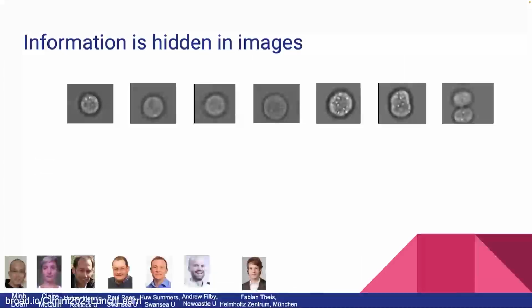But again, the other thing that I said at the beginning of the talk and then totally stopped talking about is the fact that our brains are really bad at this problem. These are imaging flow cytometer images of immune cells in different cell cycle phases. Who would like to come up and annotate all of these for me? Only once ever in a talk have I gotten somebody to say yes to that. I was very, very surprised when that person did, because it was on about the 40th time asking. You might have guessed that these are in order by the fact that towards the end they're dividing. And certainly I can tell this one apart from the other ones, but if you scrambled them up, especially these first four, I don't think I could reliably unscramble them.